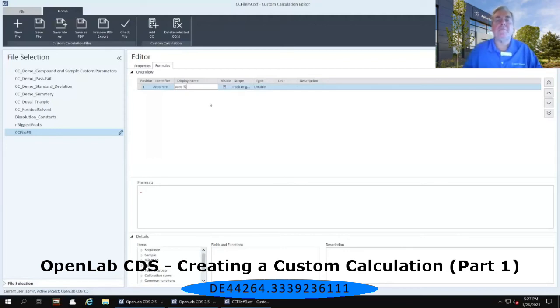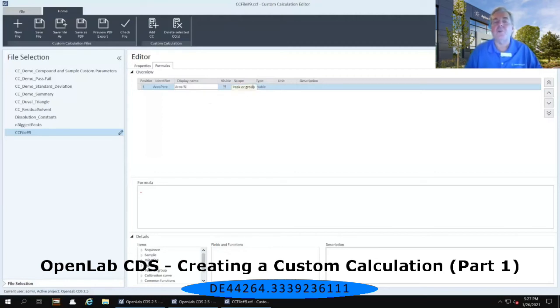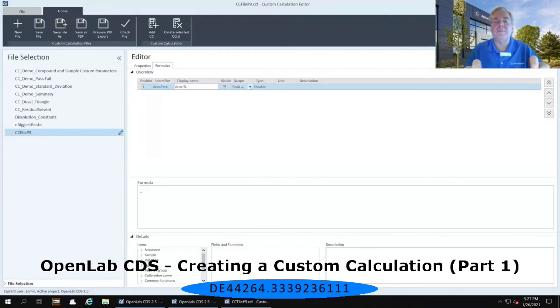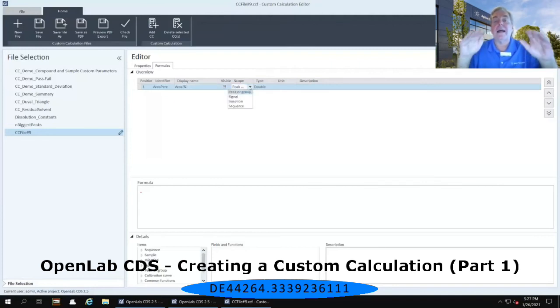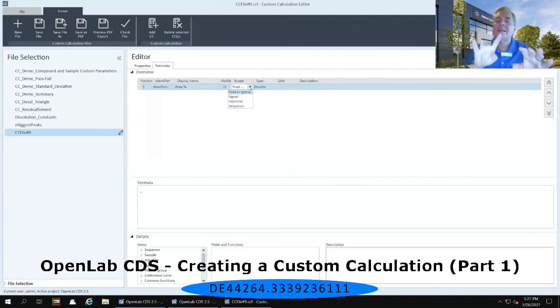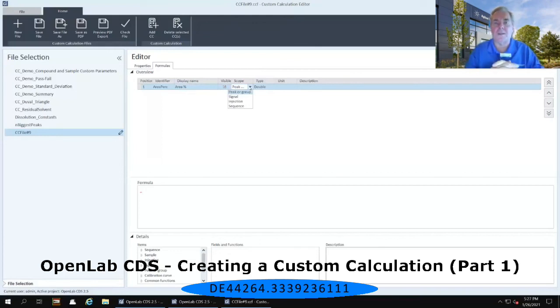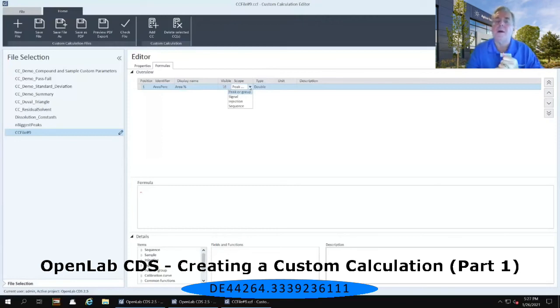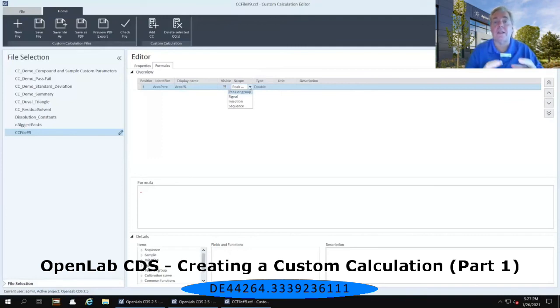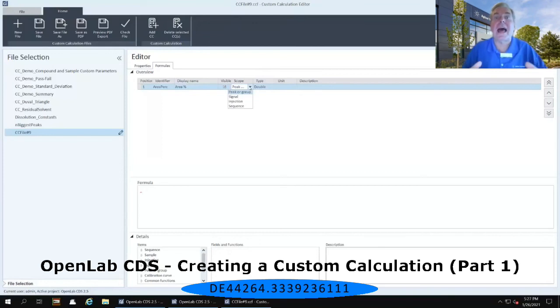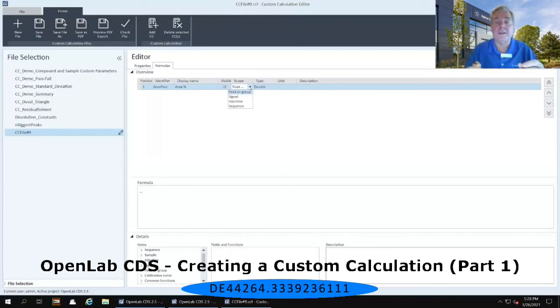Immediately to the right of that, there is a scope for the set of data. And if you highlight or hover over that field immediately below the scope, a downward-facing arrow appears. And I can click on that downward-facing arrow, and I can see that there are actually four separate scopes that are available within the custom calculation. Now, what exactly is a scope? Well, a scope is where exactly do I want to look for the data that I am going to do this calculation on?